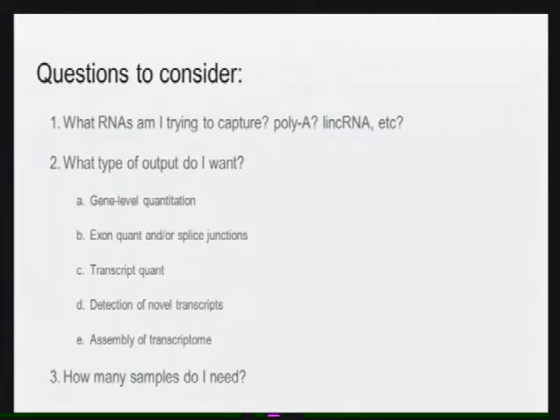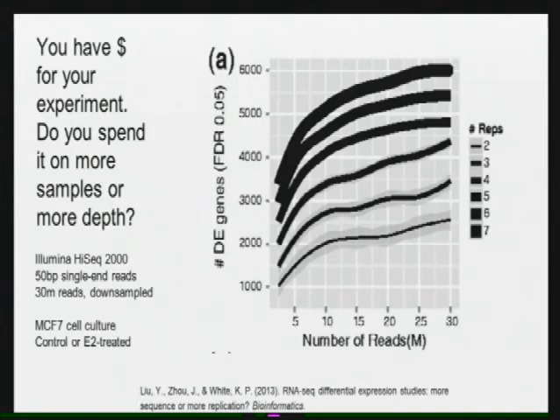And how many samples do I need? I'll just show this really quick. If you have some budget for your experiment, do you spend it on more samples or more depth? This is a question that comes up every time with a new experiment.